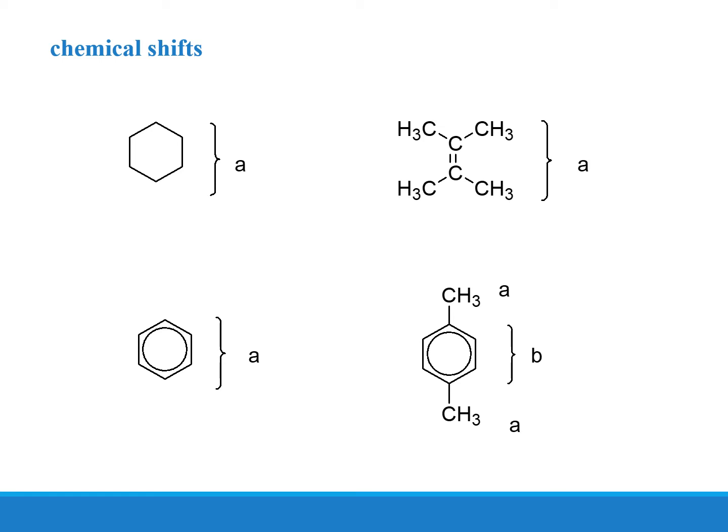For instance, in the previous example for tert-butyl bromide, you can see that the carbon attached to the bromine has no hydrogens, so it can be used as a reference. From that carbon atom, the hydrogens are equidistant.